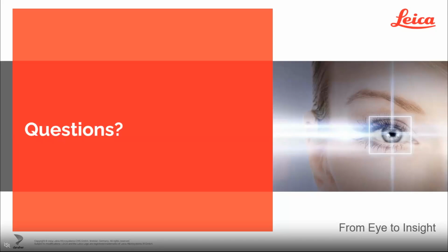I have to search for it. Sorry, I have to quickly scroll through our tech specs. Still scrolling. Here. The sample tilt is 0.05 degrees, and the step size of the rotation is 0.1 degree.